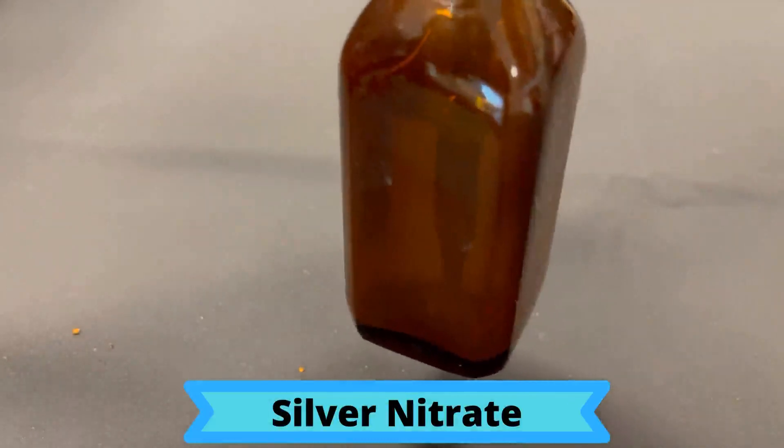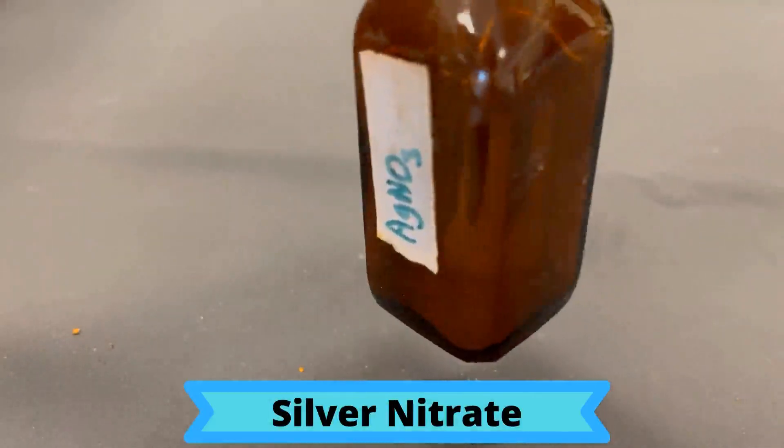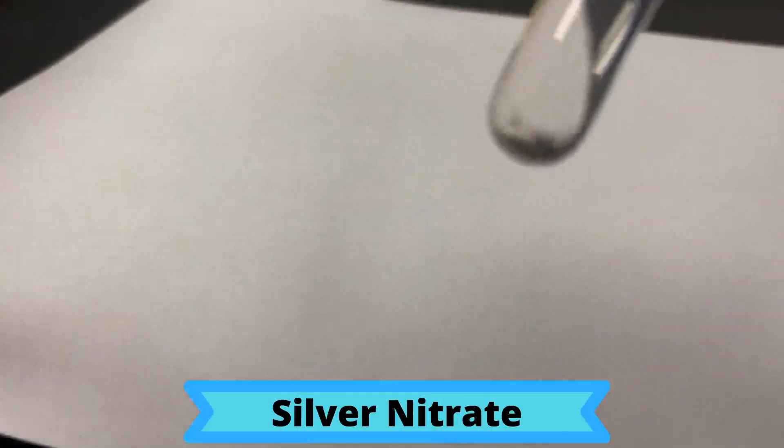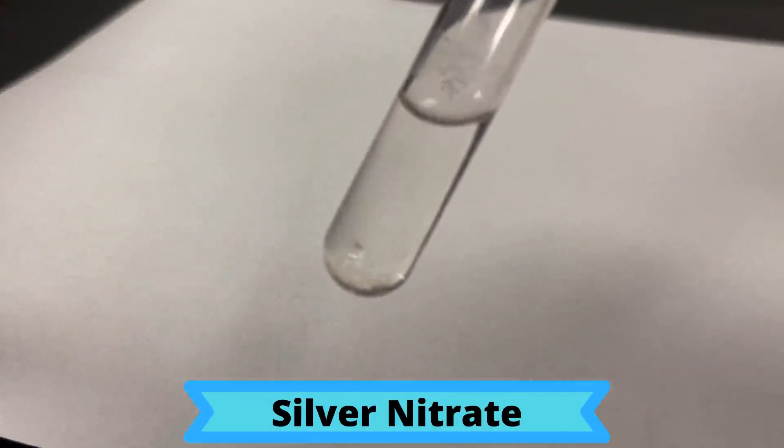Silver nitrate is a clear solution with a grayish tint. It has to be kept in a brown bottle to stop it from reacting with sunlight and breaking down.